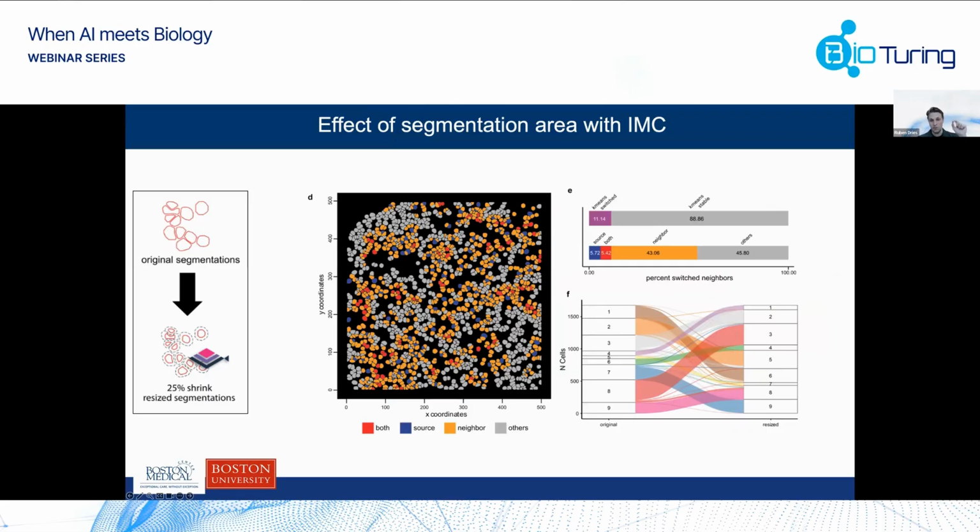You can actually see how many cells are affected. So if you did a niche analysis between the original and the shrunken version, the results might differ drastically. Even though the original was not too different, the downstream analysis might be quite different. I think that's really telling, and something we should think about when we build a story and have data that we want to show and publish: how robust is it, for example, to downscaling or upscaling, and what does it tell us about the data?